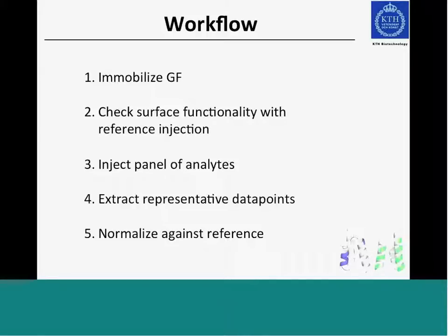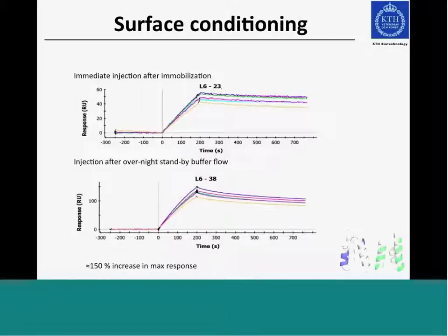So one thing to note here is that one trouble that we encountered is that when we started doing injections right after immobilization, we got quite low responses. And we didn't really know why that was. So we decided that we would leave it in standby overnight to see if the coating on the surface is not really folding properly, if we could make it better in some way. So we did the same kind of reference injections the next day, and immediately we see a very, very high increase in response. So that was very nice to see. But this could of course vary from case to case.